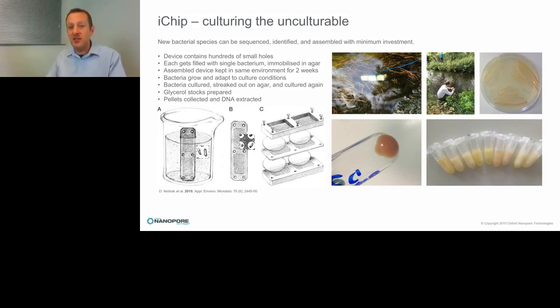Using sterile cocktail sticks, I pushed the agarose plugs into separate wells of deep well plates, which were filled with low salt LB medium, except that the medium had been made with sterile river water instead of distilled water, just in case the bacteria present had specific nutritional requirements. The plate was then left at room temperature and exposed to daylight for about 3 days.